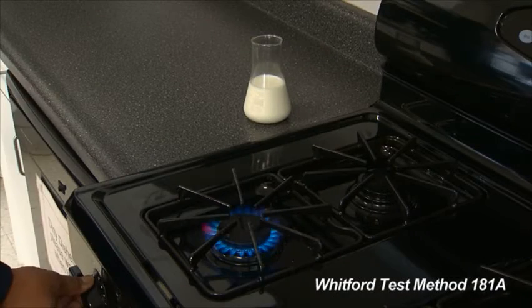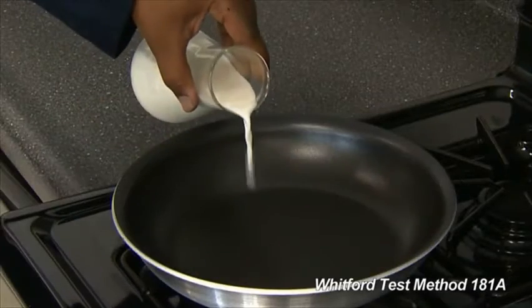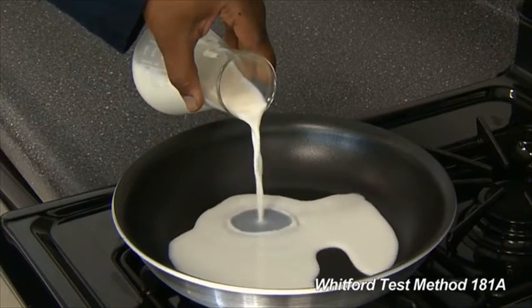With the burner on a medium setting, place the pan on the burner. Pour cold, fresh, whole milk into the pan so it covers the surface.